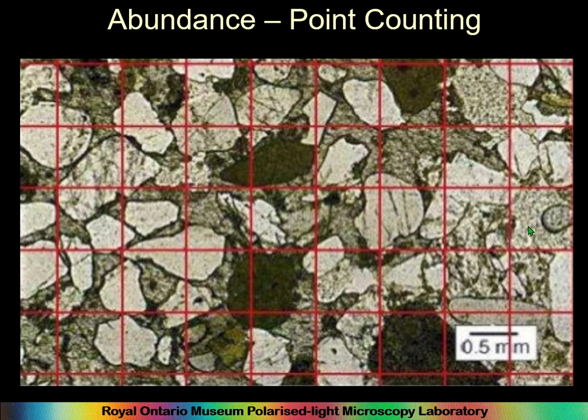So if someone says, I'm doing point counting so I can get accurate data, and they're not doing 1,000 points, they're not doing that right either. Unless they calculate the counting interval, and unless they do a significant number, and I don't mean 100 or 200, they're doing it completely wrong.